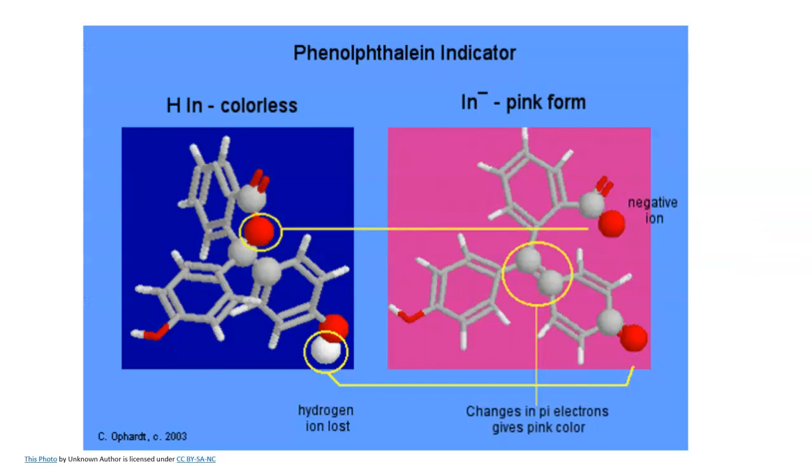So now, because acidic and basic solutions are generally clear and colorless, you have to monitor the progress of this reaction very closely, and you're going to use an acid-base indicator or some other substance that changes color with the pH. The most commonly used indicators are methyl red, bromothymol blue, and phenolphthalein.